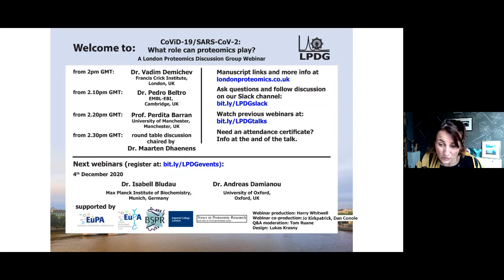In terms of referencing, we will reference from a single site RT-PCR. And then we will know something at a large number of samples with CT values. What is interesting, as I'm sure you know, is that many, many hospitals are now using quite a wide range of diagnostic tests, which have very different sensitivity and specificity. So we will, by the way, also be assaying that against mass spectrometry. And I think finally we will have standard reference peptides or something that we will compare against. So there will be a quantitative assay that will be internal, and as you know, that's one of our strengths.